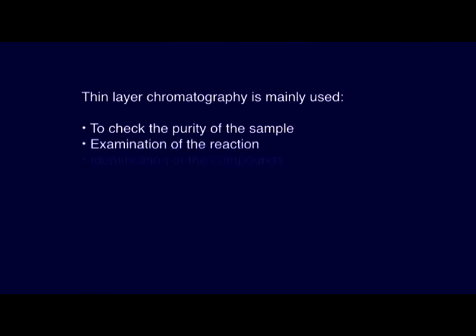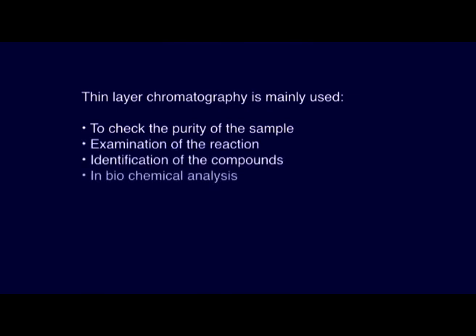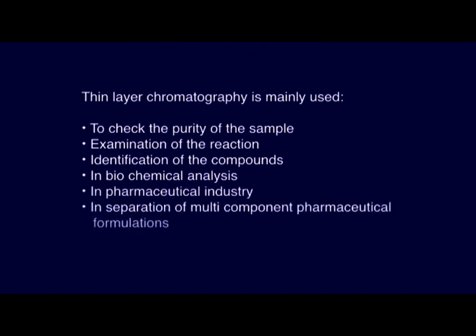Thin layer chromatography is mainly used to check the purity of a sample or to monitor a reaction, that is, to examine whether the reaction is complete or still going on, what the starting material is, or how many products have formed. It is also used for identification of individual components in biochemical analysis, in the pharmaceutical industry for separation of multi-component pharmaceutical formulations, and in the food and cosmetic industry for the separation and identification of the individual components present in the system.